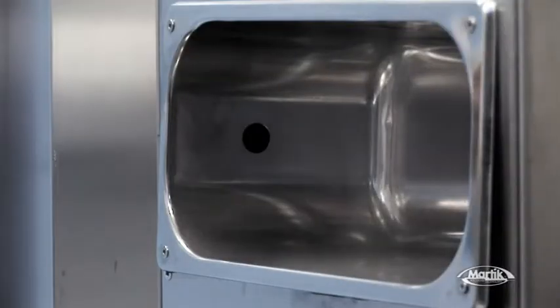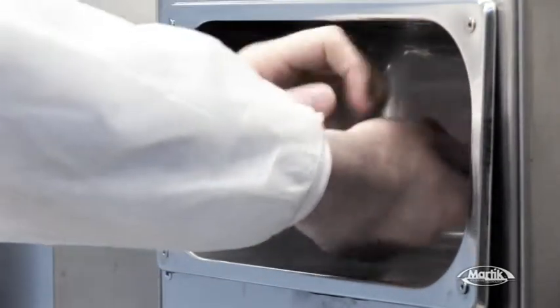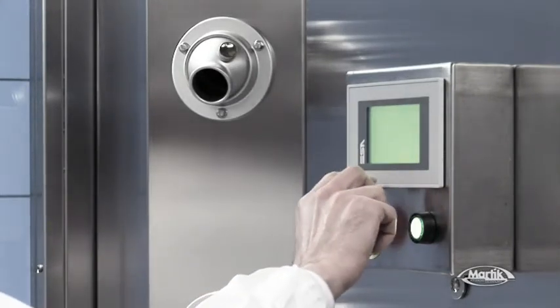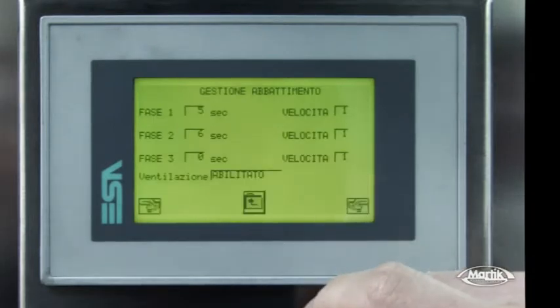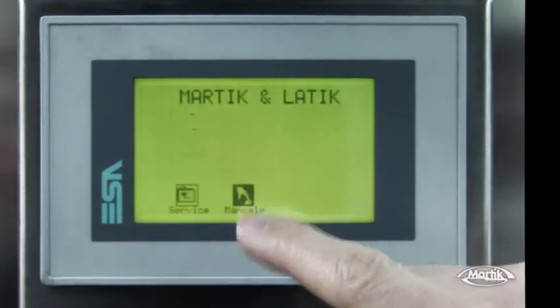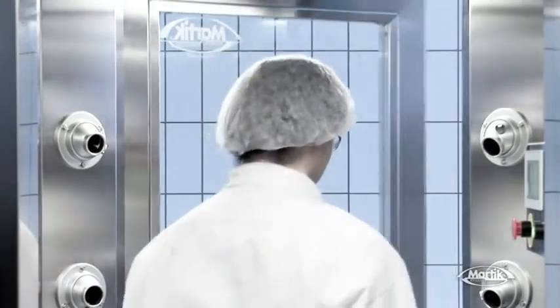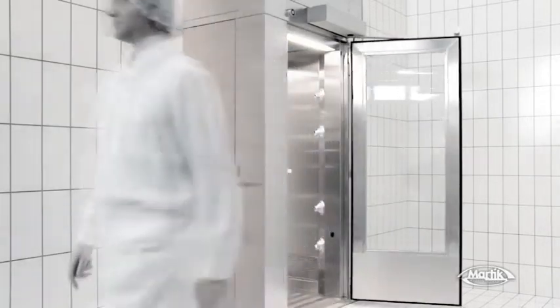You just need then to place your hands into the nebulizer to have them disinfected. The control touchscreen monitors all these steps and stores any of the operations that the user has skipped or performed incorrectly. After the sanitation process, the door opens automatically and you can move on into the clean room.